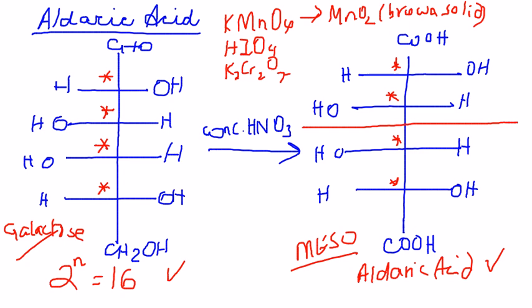Periodic acid, it's in the nature of periodic acid. Recall from organic 1 that if you have a diol, it's actually going to cleave right here in the middle, so it's going to actually rip the molecule apart. Dichromate, that's a toxic compound and also gives you low yields of the final product. I call dichromate a toxic compound just because, not by itself, but the chromium that you have is in the +6 oxidation state, and +6 oxidation state should not get into your system, essentially.